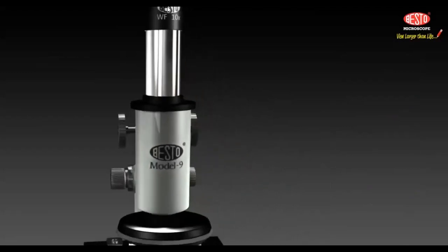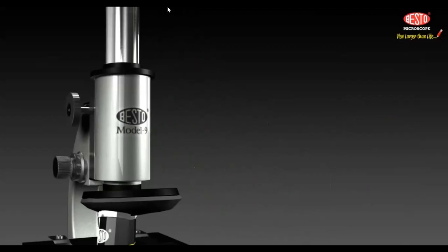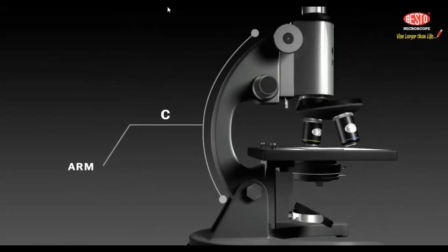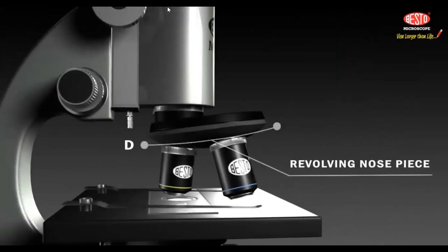B. The body tube holds the eyepiece in position over the revolving nosepiece and the objective. The body tube may be straight up and down or slanted. C. The arm is the curved metal piece that holds the body tube in place over the stage and the base. D. The revolving nosepiece holds the objectives and allows you to change objectives while looking at a slide or sample. E.